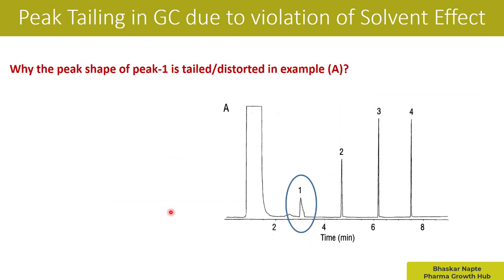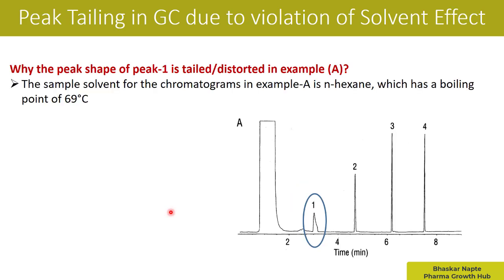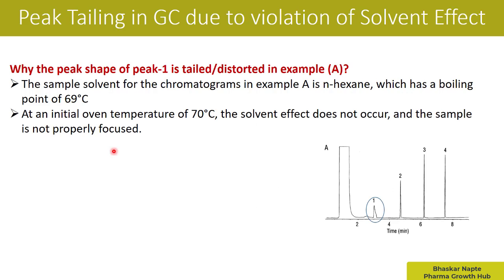Let us go back to our original question: why is the peak shape of peak number one tailed or distorted in example A? Focus on peak number one — it is quite distorted with a lot of peak tailing. The sample solvent for example A is N-hexane, which has a boiling point of 69 degrees Celsius. The big flat peak is the solvent peak, belonging to N-hexane. The initial column temperature in example A is 70 degrees Celsius, and at this temperature the solvent effect does not occur, so the sample is not properly focused.